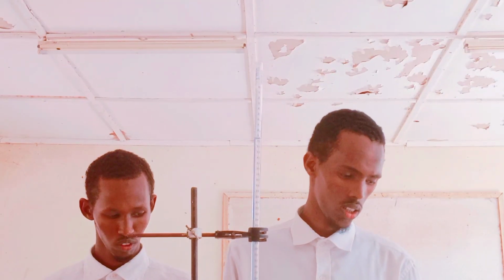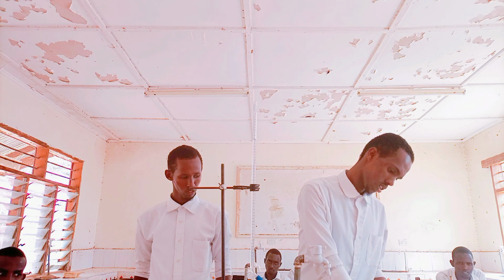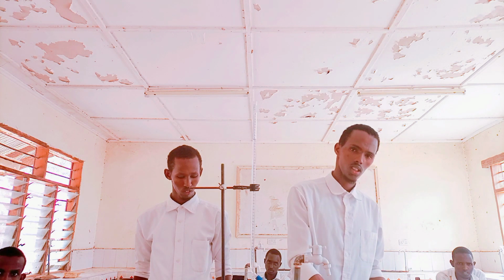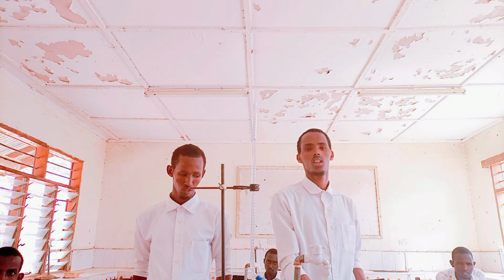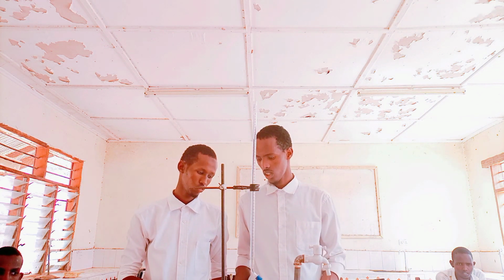Now you can do more of that. You can repeat two more times so that you get accurate results. But since we did it accurately, we are able to fill that table for titration, and there is a way to do it.